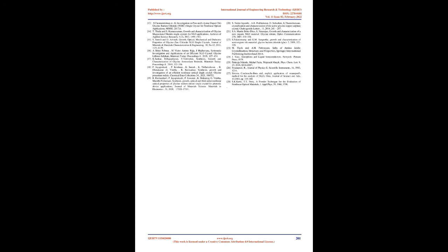2. Nonlinear optical properties. SHG conversion efficiency measurements of the grown crystals have been carried out using the Kurtz and Perry technique 28. It is a popular and powerful tool for the initial screening to evaluate the conversion efficiency of NLO material. When barium chloride is added to pure glycine, the relative SHG efficiency is reported to be 0.5 times that of KDP crystal 22. When magnesium chloride is added to pure glycine, the conversion efficiency reduces to half of KDP 14.